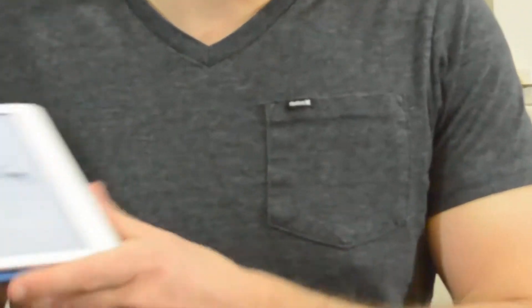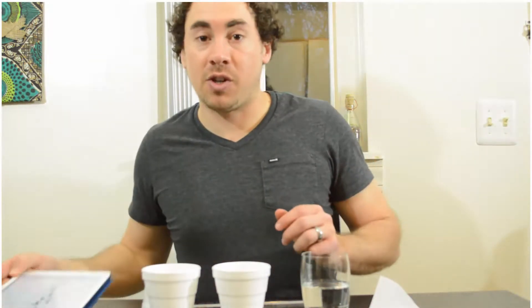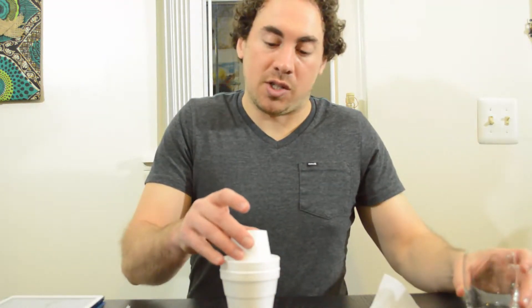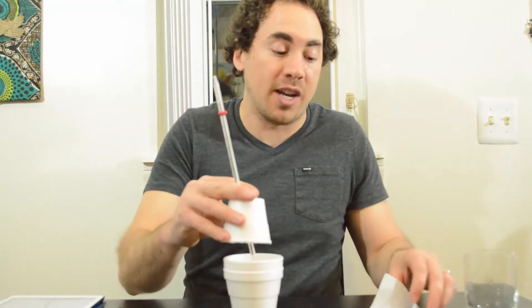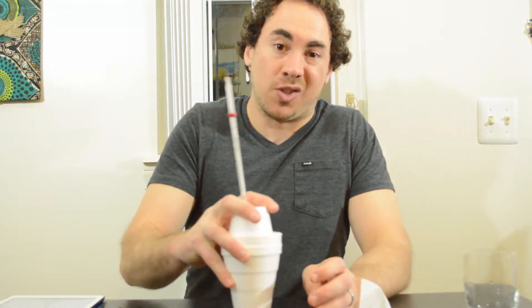The reaction we're going to do in our calorimeter is the dissolving of calcium chloride. I have solid calcium chloride and I'm going to dissolve it into 100 grams of water. First, I have to construct my calorimeter. I added an extra piece — another cup cut down smaller with a hole through it — to hold in the heat and allow the thermometer through. I take the initial temperature of the water first, add it to the calorimeter, put the top on, and insert the thermometer. After waiting a couple of minutes for the temperature to stabilize, I add the calcium chloride and stir by swirling — never stir with the thermometer as you might break it.